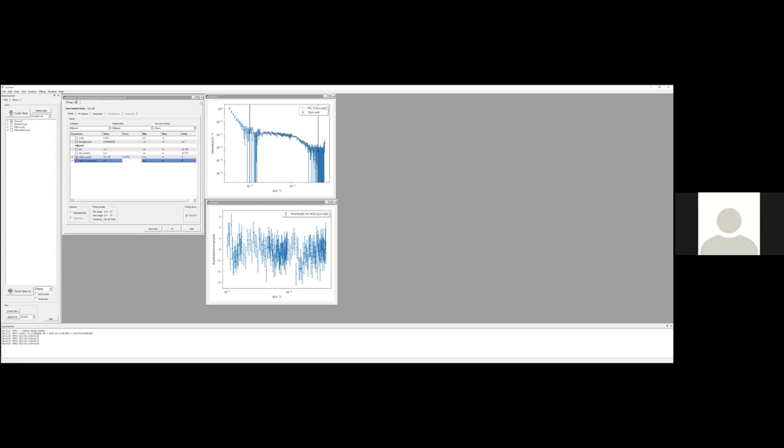Sorry, right. Susana, do you mind saying the numbers again? Because your screen is so small that I don't see it. Oh, sorry. So it'll be in your instructions, but I'll say it again. The polar radius now fits to 22.1. And the equatorial radius, I changed it to 12. It was 10 before. So I increased it slightly to see how it would affect the other radius. I changed it to 12, and then it fit to 22.1 instead of 20.